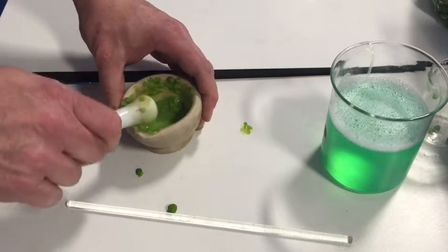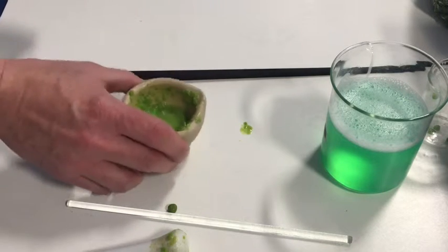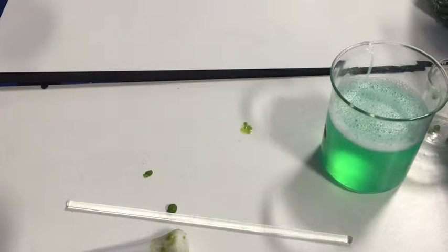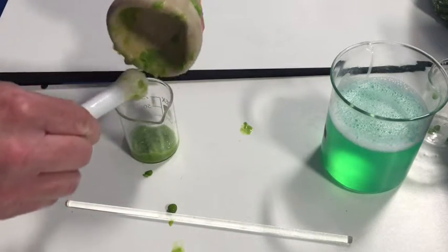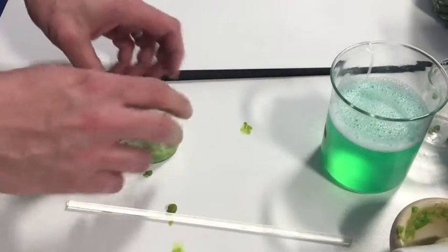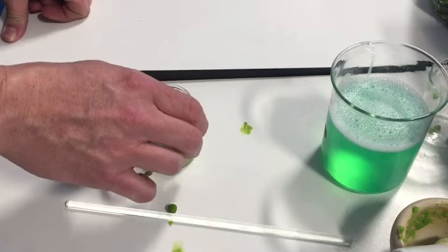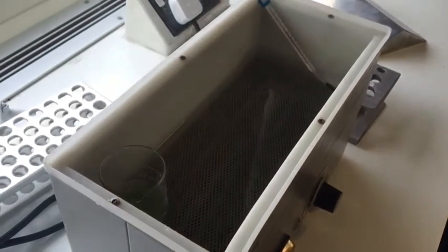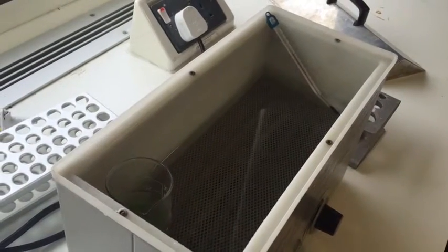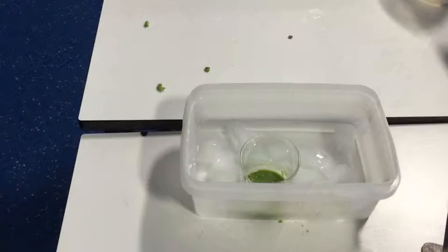We now have a wonderful pea, salt, and washing up liquid smoothie — tasty, maybe not. Take that and put it into a small beaker. To give it time for all the cells to be broken open, we're going to incubate this at 60 degrees for 10 minutes in a water bath. Be careful — 60 degrees is a burn hazard. Make sure you know which one is yours.